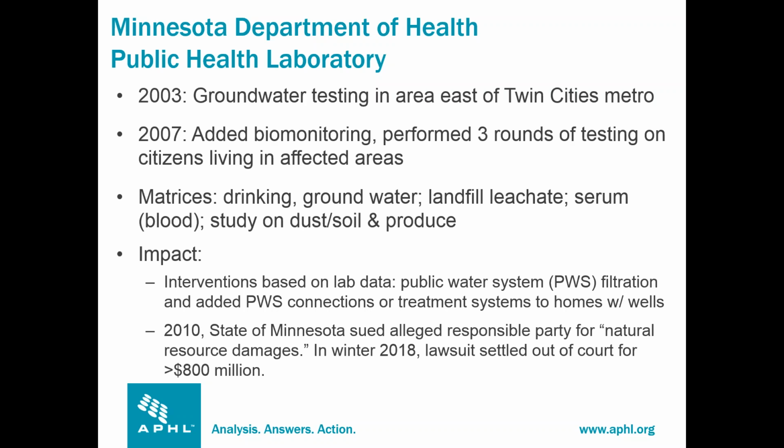The purpose of that testing was to determine body burden and to assess groundwater treatment effectiveness. The matrices that they've been testing for over the past 15 years include drinking groundwater, landfill leachate, the serum I mentioned, and then also they've been doing a few different studies, one on dust and soil and produce. So they have a wide variety of matrices that they've been able to analyze for.